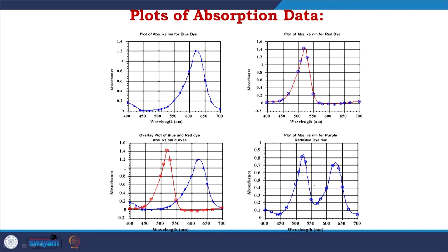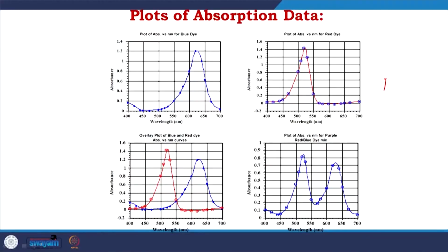In that way you could characterize them and know the concentration, and that is where it is very commonly used, because with any spectrophotometer you could calculate the absorbance. So, for any unknown sample you are working on, you make the solution and you could get its concentration.